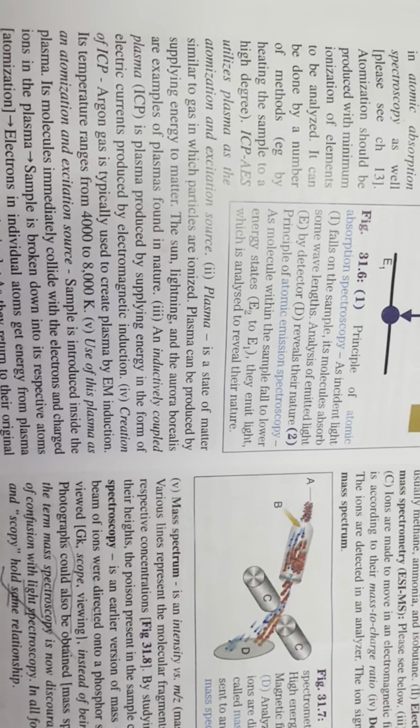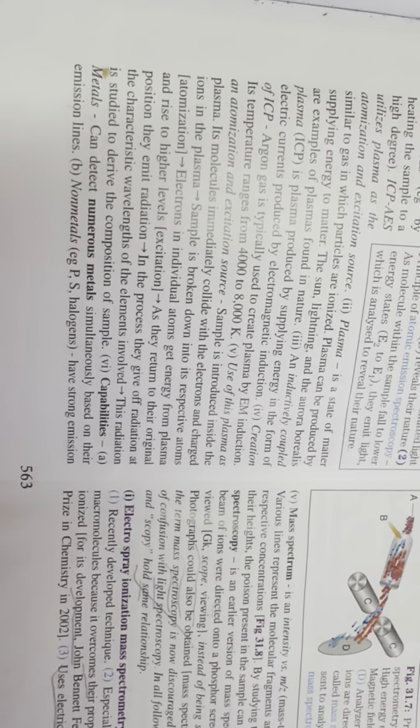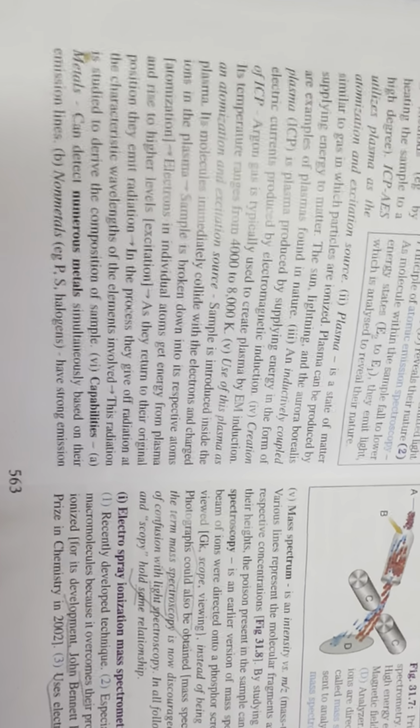Electrons in individual atoms get energy from the plasma and rise to a higher excitation level. As they return to their original position, they emit radiation. In the process, they give off radiation at the characteristic wavelength of the element involved. This radiation is studied to reveal the composition of the sample.